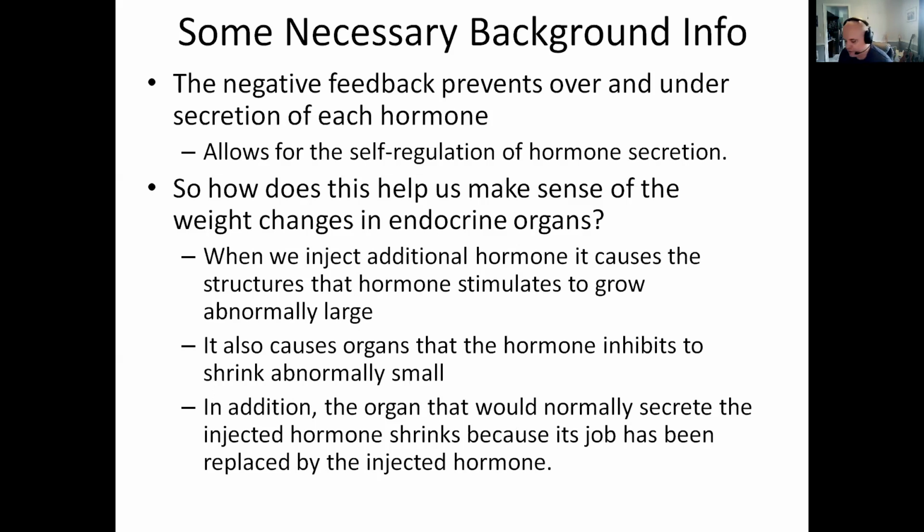So what does that mean? If I inject a rat with testosterone, and this is an intact rat that still has its testicles that are already producing testosterone, a number of things are likely to happen. One is that you're going to hyperstimulate all of the things that testosterone would normally stimulate, which is what? Body growth and sexual reproductive growth. So we should see an increase in the mass of seminal vesicles, increase in overall body mass, and likely an increase in prostate mass if we add additional testosterone, right? Okay. But what should it also do?